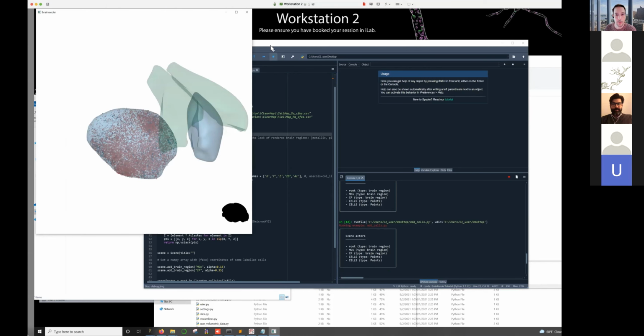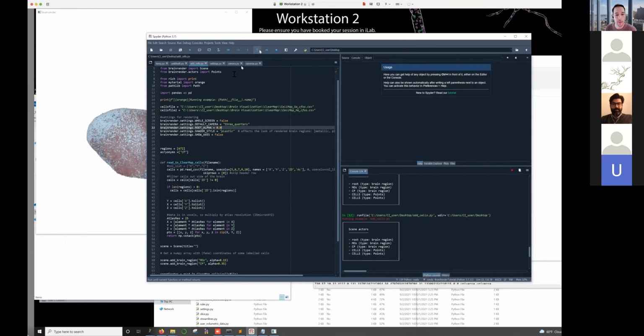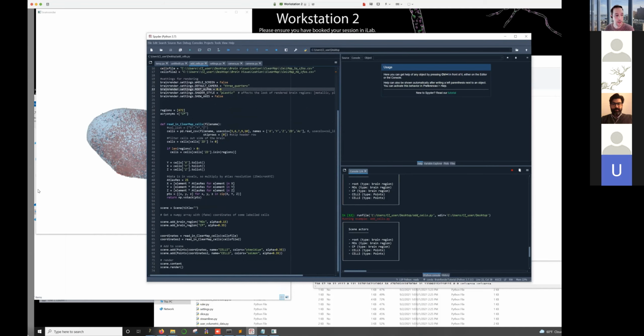One other thing that we can do here that can be useful, because looking at the point clouds can be a little bit hard to interpret sometimes: BrainRender is really just about these simple visualizations, but you can do a little bit of work in terms of plotting these densities or the density clouds, kind of like the heat map that you can generate in ClearMap and BrainJ. You don't have so much control over how transparent the plotting is, but I can show you how to do that. We just need to add a little bit at the bottom of the script here.